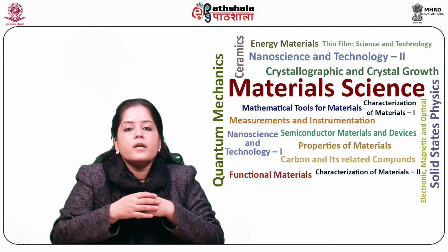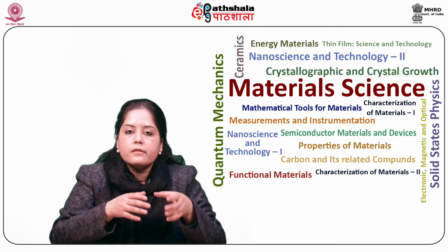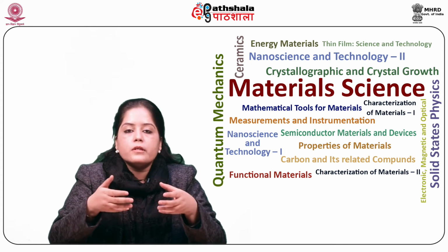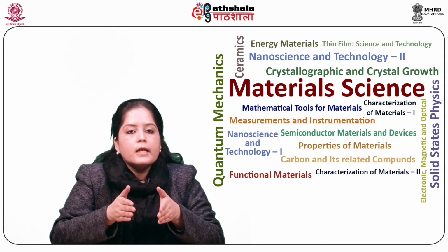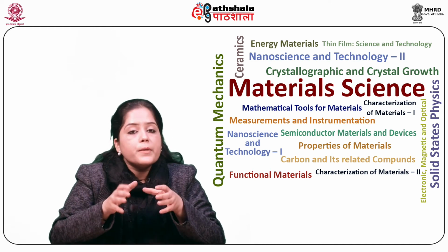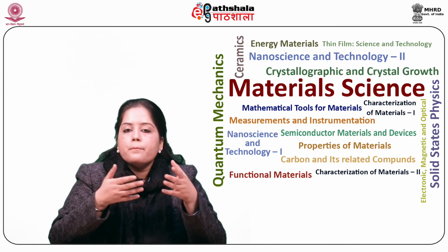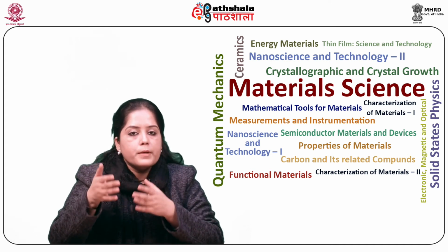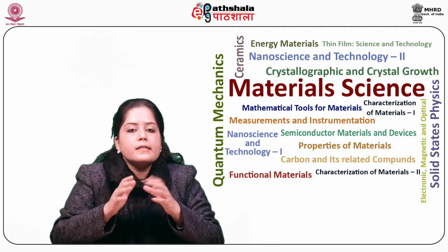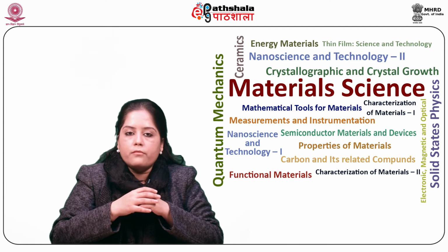So, to address the fundamental mechanisms underpinning the functionality of ferroelectric materials and devices, domain structures and their evolution under bias have to be studied at the micrometer and nanometer scales. So, the rapid development of scanning probe microscopy and especially piezo response force microscopy (PFM) has resulted in a fabulous advancement in this area, as it will be highlighted later after the short description of the method.